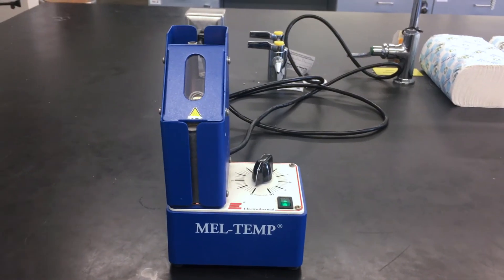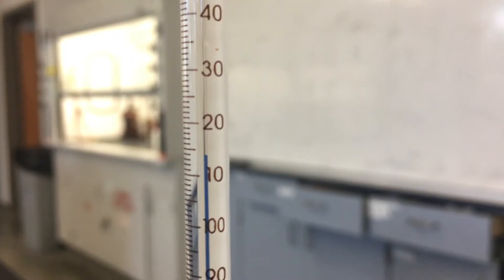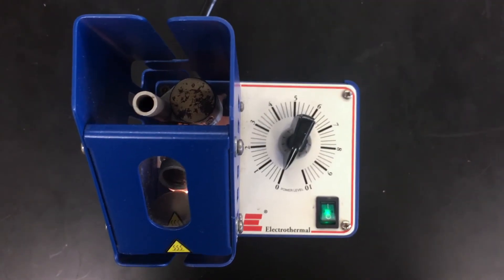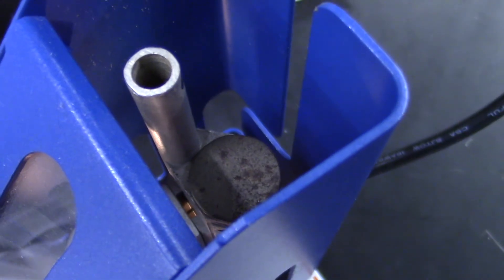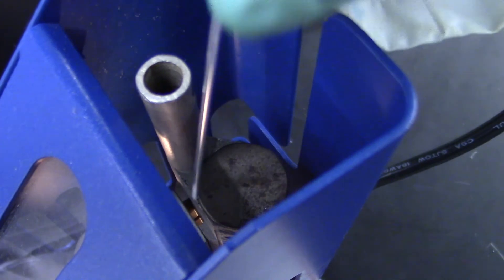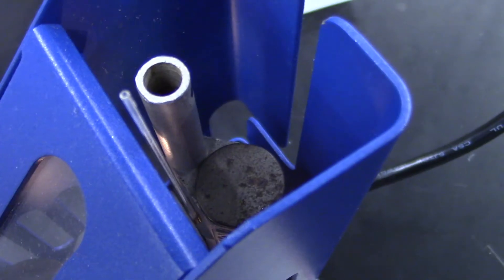The analog apparatus requires a mercury thermometer. It shall be inserted into the designated holder. Place the capillary in the same fashion as with the Digimelt device, and insert the thermometer.